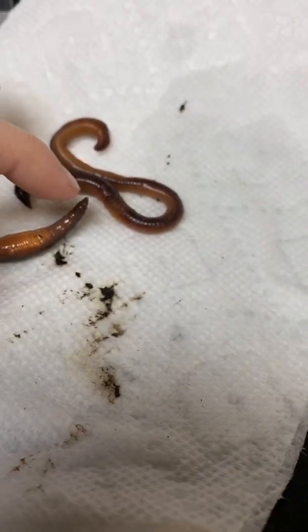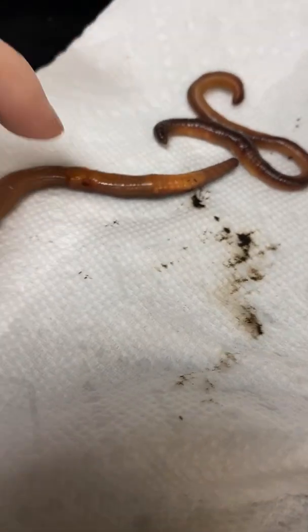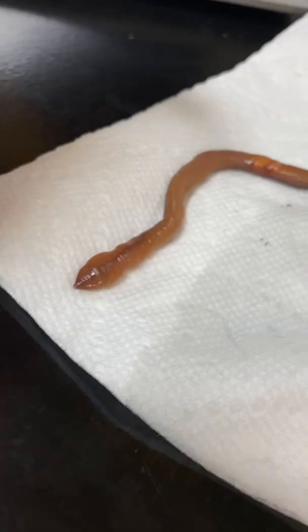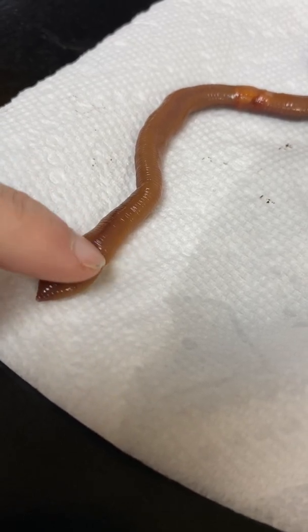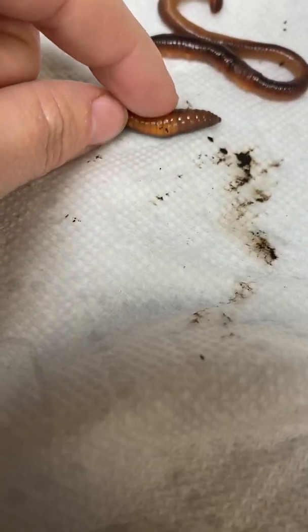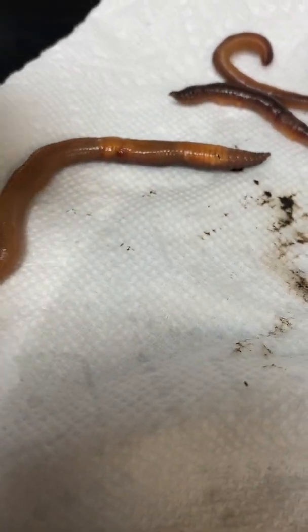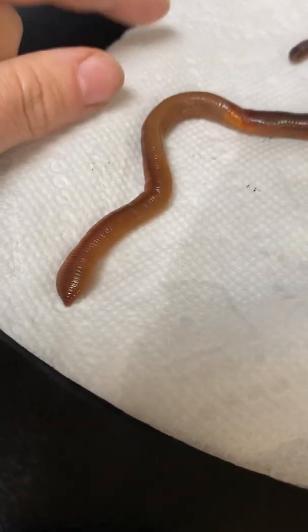The head end is more pointed. You can see the prostomium, they move a lot more with it. It is also closer to the clitellum. And that's the anterior end. The posterior end looks more like a spearhead and it's more flattened, and that's the anus. So the anterior end is a little bit more pointed at the end and is closer to the clitellum. And it's actually a lot darker towards the anterior end than the posterior end.